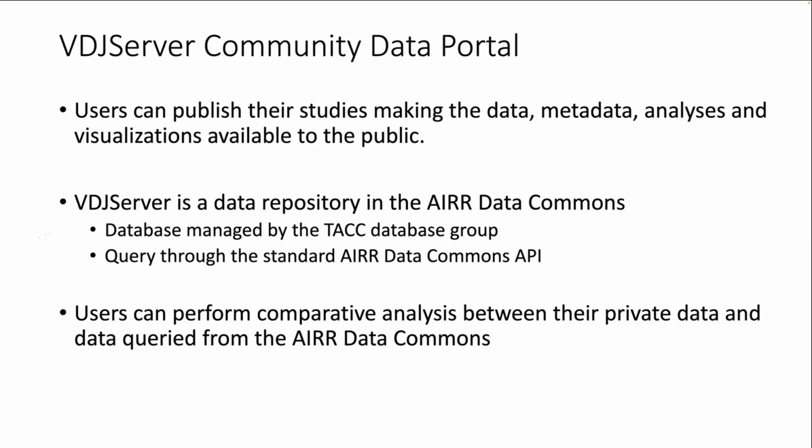As I said, there's an API, which is a programmatic interface for programmers and bioinformaticians to use. In VDJServer, we developed a GUI interface that we call a community data portal. That actually has multiple parts. You can use VDJServer to publish your studies: you can upload the data, put in the metadata, and then publish it, and then people can download it, query it, and also look at analyses and visualizations that you've done.